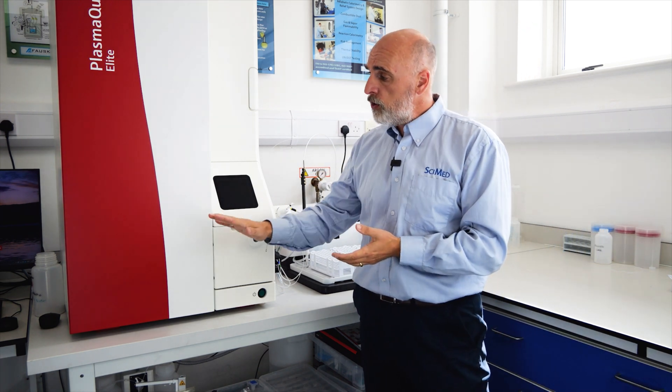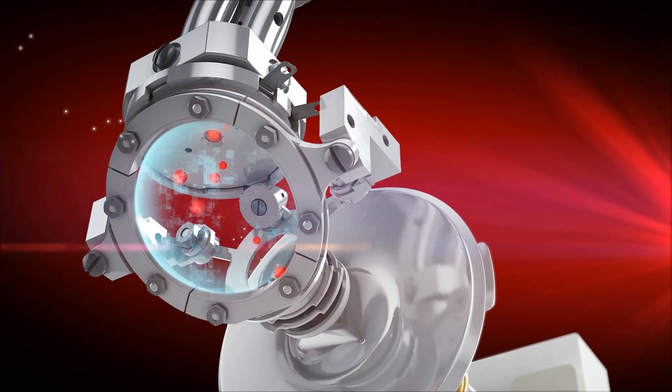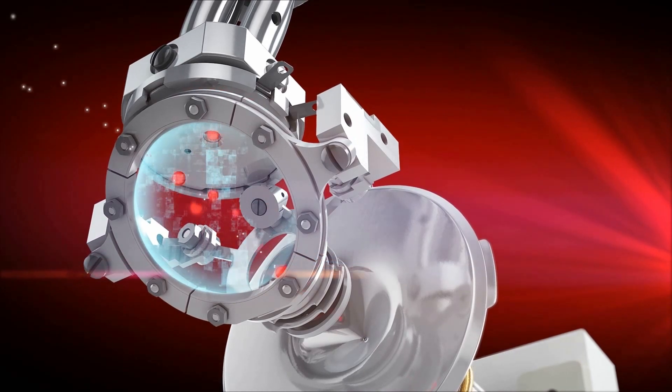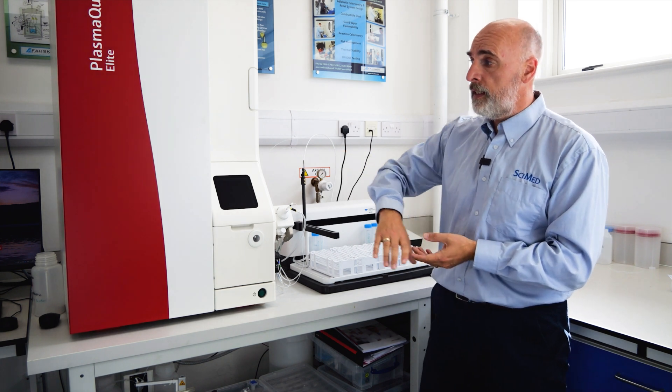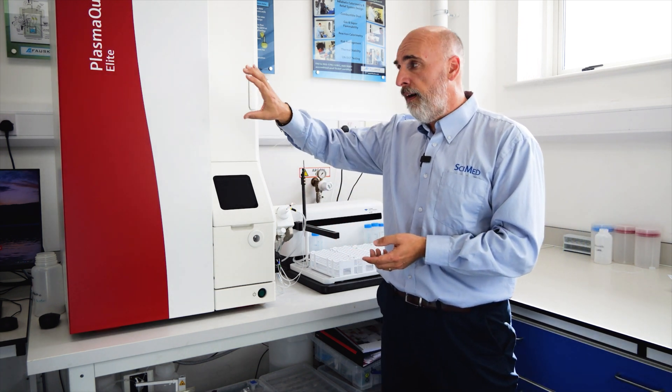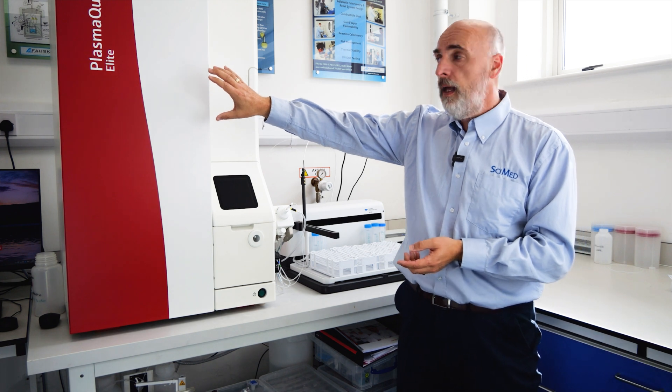The ion beam then travels through, goes through a 90-degree bend, and passes something called the reflexion. The reflexion is there to refocus the ion beam and prevents it from diverging. So we end up with more ions going into the mass spectrometer, which is a very high resolution mass spectrometer, and those ions then carry on through into the detector.